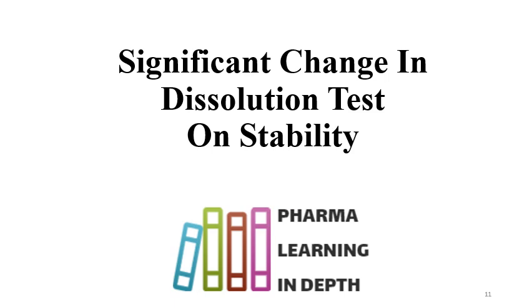In the present video we have seen what is dissolution failure, when you can say that dissolution failure occurred, what is significant change in dissolution, what are the consequences, why dissolution failure occurs, how we can investigate, and how we can prevent or avoid the dissolution failure. So whenever you are performing stability studies, always have a good understanding and clarity of the basics for data evaluation.